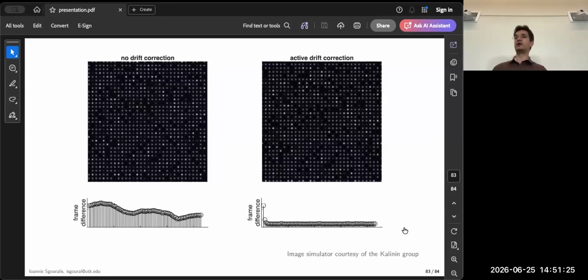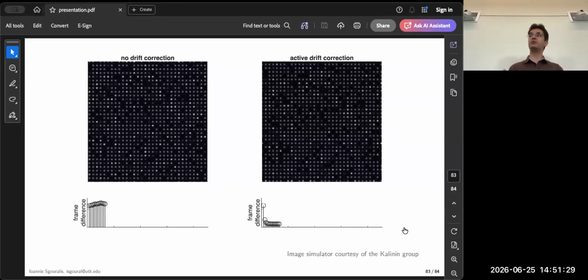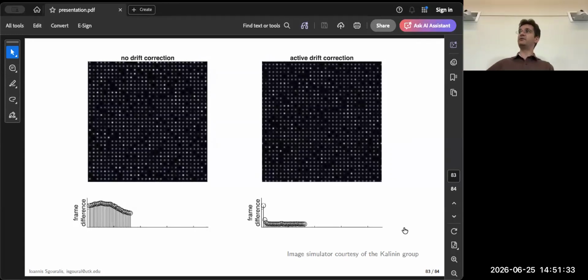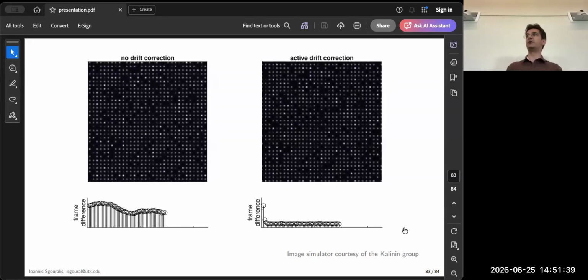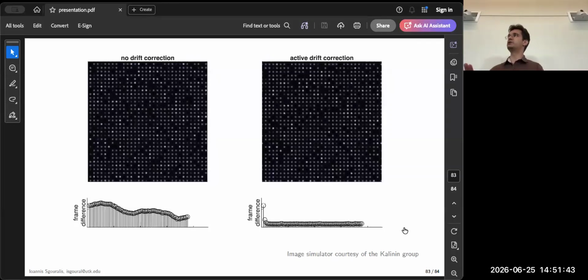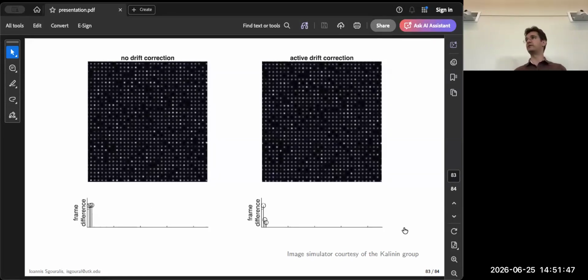And there are two reasons for that. One is reconstruction is expensive by itself. Second, we need to be thinking about methods that can give you results while the microscope is moving from one pixel to the other, which is extremely, extremely slow by itself. So the second question is mostly a different type of problem than what I've been focusing on today.